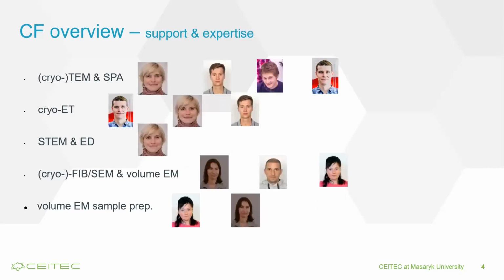Apart from the training, we can of course do the service and provide the expertise. For structural biology, the technique is primarily called single particle analysis, and you will probably meet Karel, Matthias, Dan, or Zuzka for both the data acquisition and the support with data analysis.